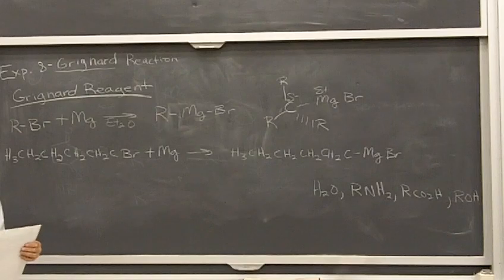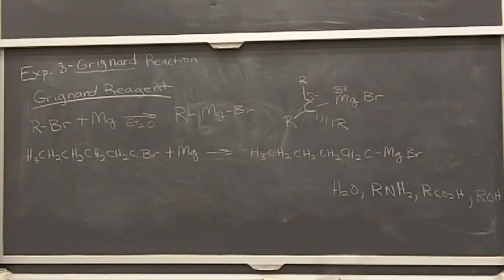Yeah? We'll cover these side reactions in our notebook. You don't necessarily need to put them in your notebook, but be really aware of them. I would understand what's happening with each of them. So know what happens when it reacts with oxygen, know what happens when it reacts with water, or tries to react with itself, okay? But what we need to do is add things dropwise.